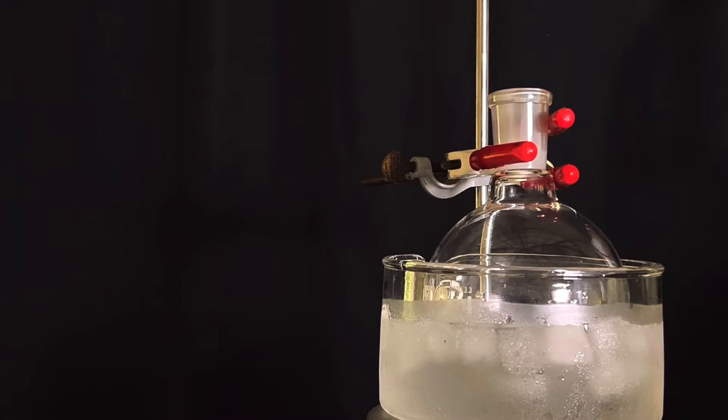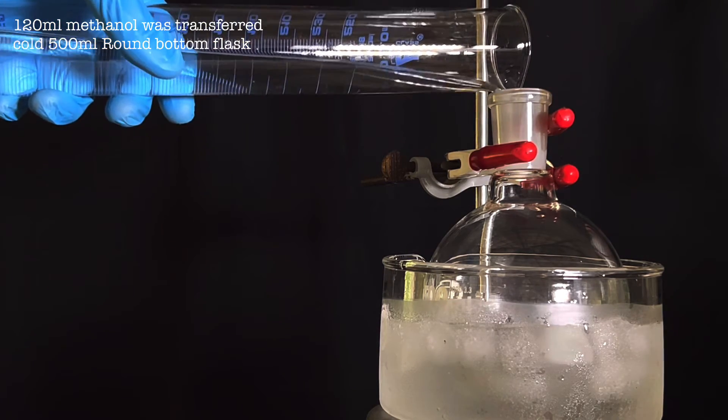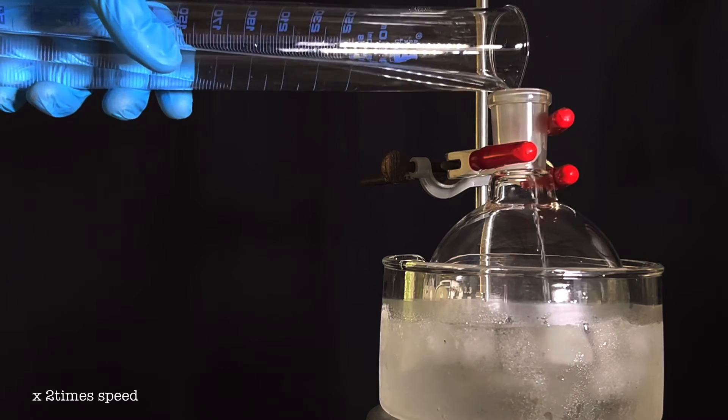Start by fixing a 500 ml round bottom flask on a stand inside an ice bath. 120 ml of methanol was added to the flask and the methanol was allowed to chill.